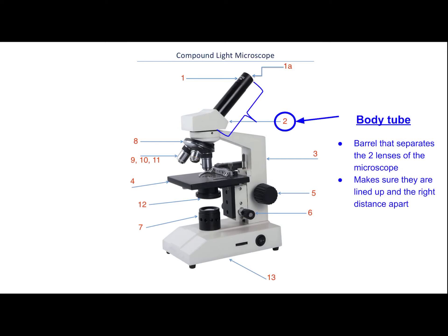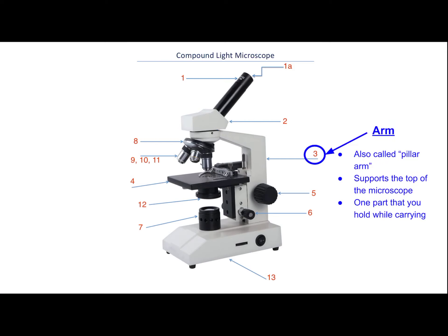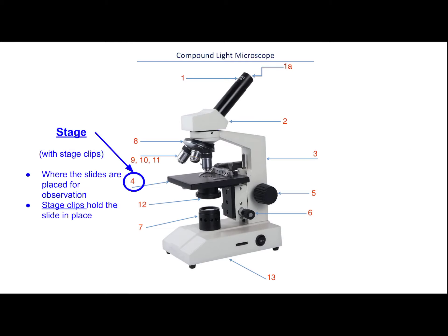The next piece is the arm — sometimes also called the pillar arm. The arm supports all of the top working parts of the microscope. This is one of the parts that you can and should hold on to while you are carrying the scope around.